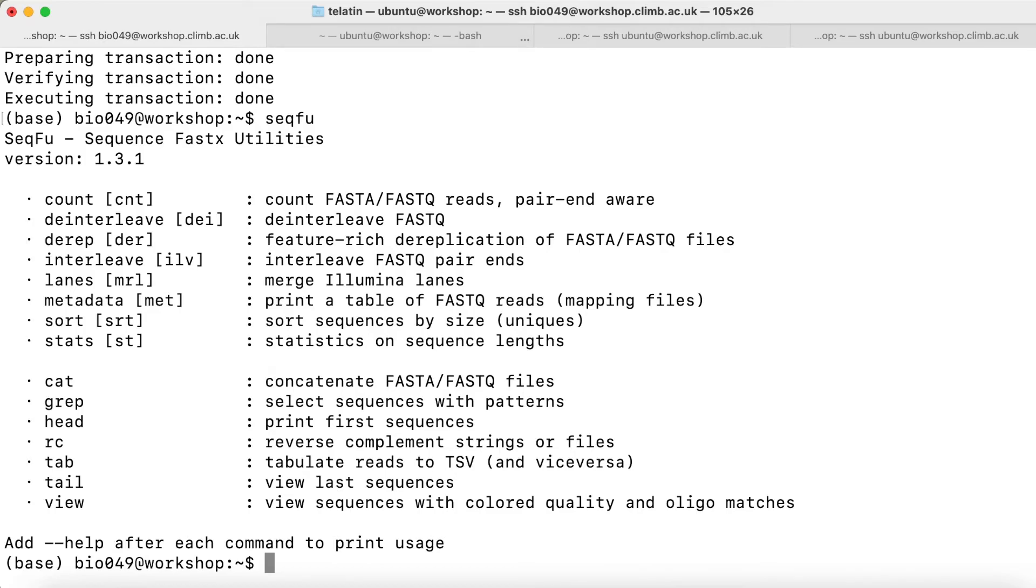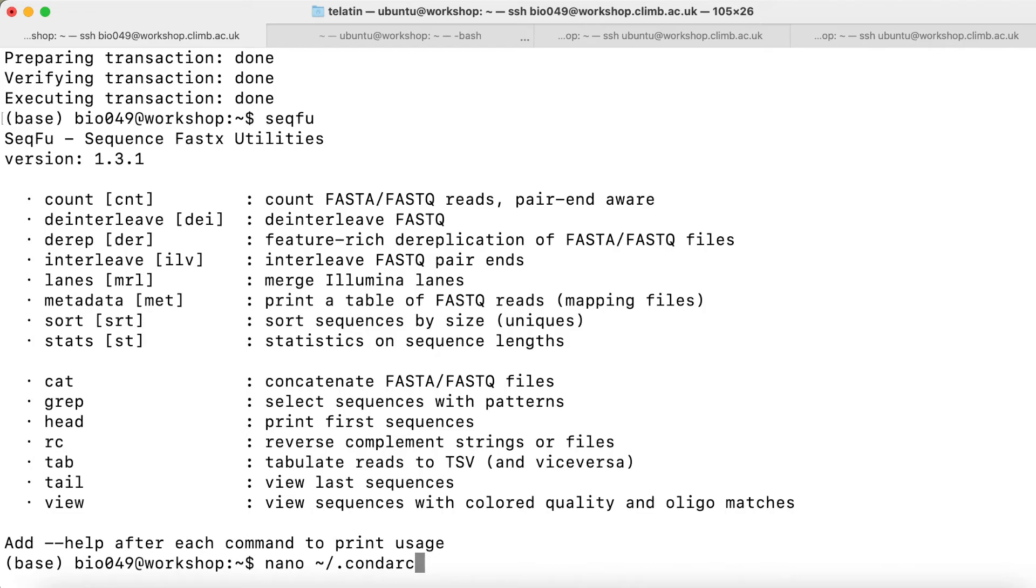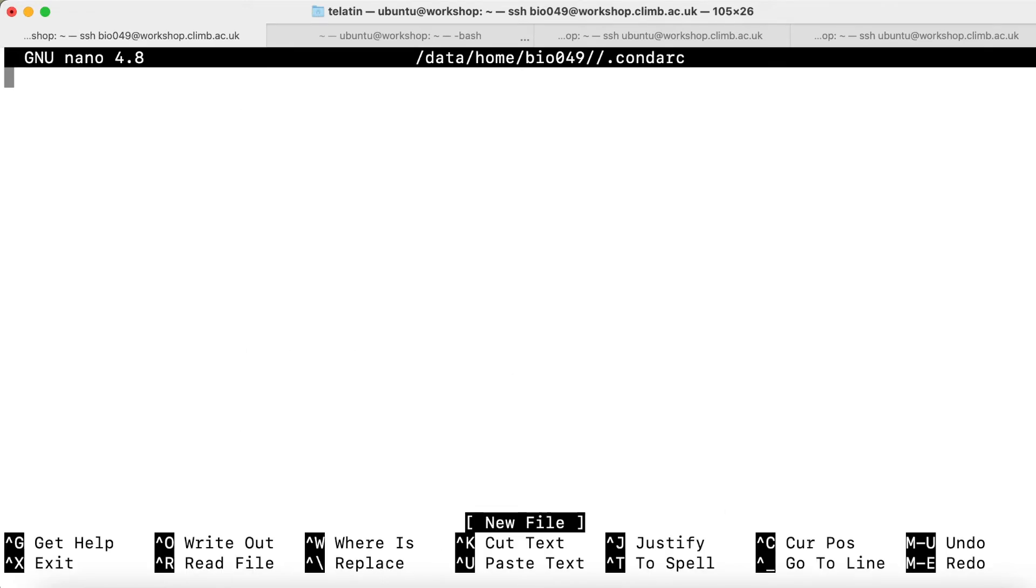Since conda-forge is often required by the dependencies of the packages that we want to install, we can create a Conda RC configuration file. We can type nano tilde slash to specify that we want to save it in our home, and then dot Conda RC. The dot at the beginning of a file means that it's a hidden file, and usually configuration files are like dot program name RC. We hit enter.